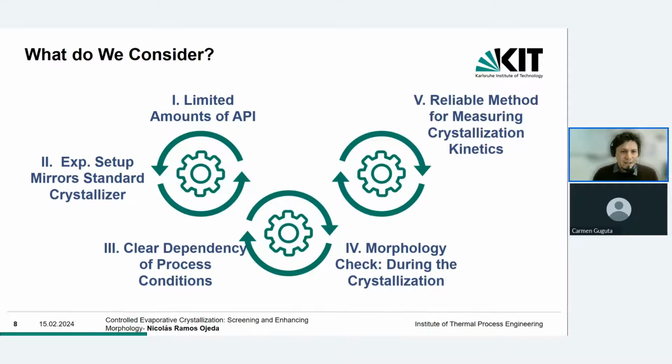And a final step is a reliable method for measuring crystallization kinetics, but this topic will not be addressed during this webinar.